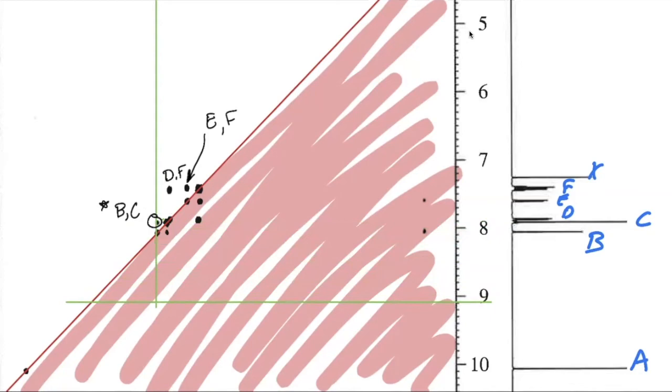What I'm seeing though is that this peak here is actually two peaks right next to each other. It kind of looks like one circle is here and the other one is butting up right next to it. So that's what I'm seeing there. And I think that has to do with the close nature of C and D on our axis.